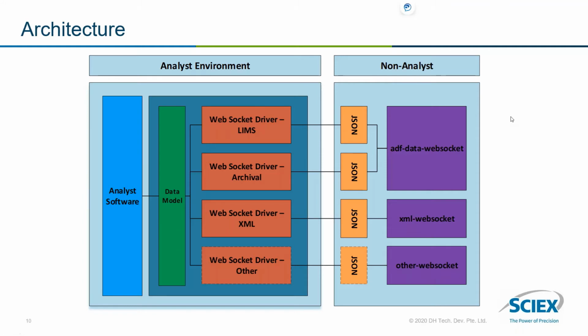So a more detailed representation of the SCIEX implementation. We have the Analyst software. We've created a data model that wraps all of the APIs and all of the data produced in the Analyst software. And we have created the ability to plug in a WebSocket driver in the client code. Roughly, the WebSocket driver corresponds to a use case. And you can see here that we've already produced a LIMS interface driver and an archive driver.